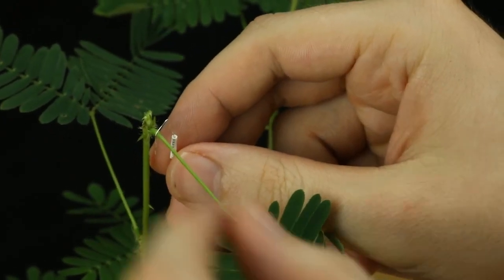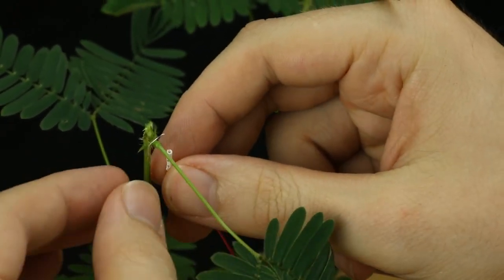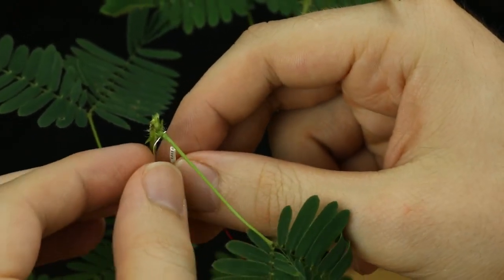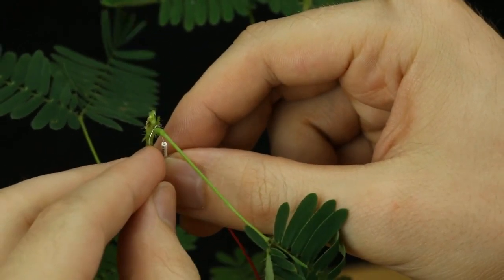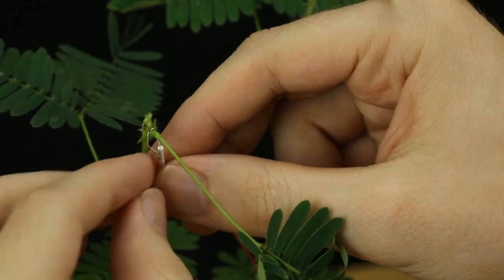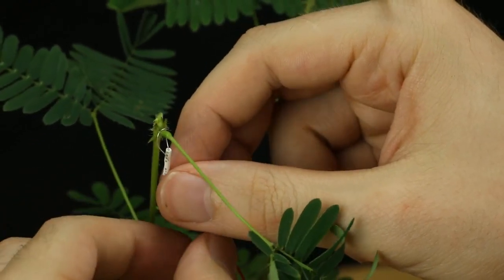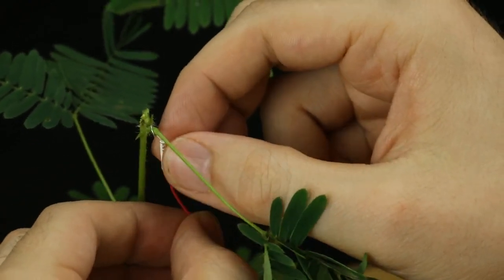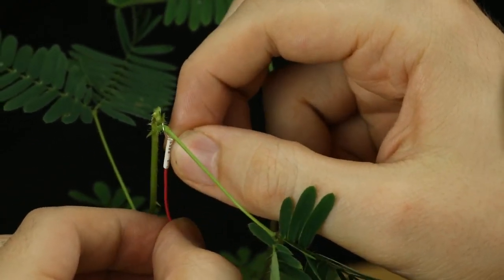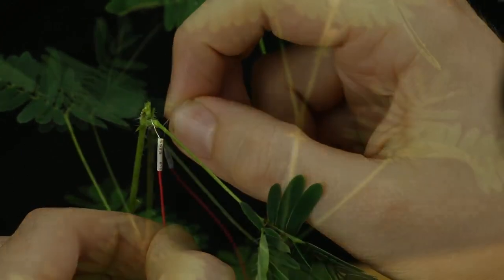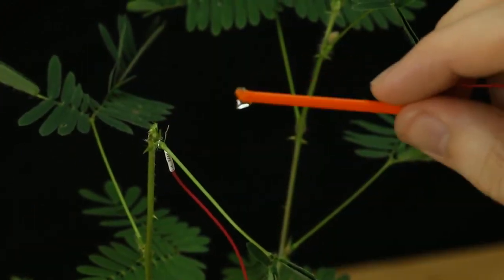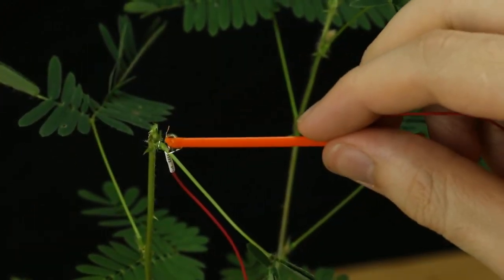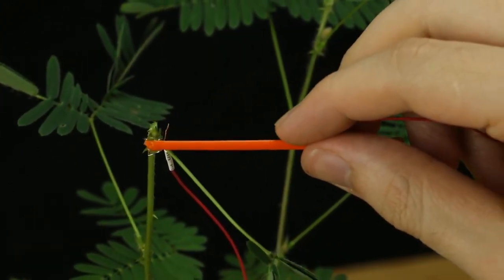You'll begin by picking out your sensitive mimosa, picking a branch, and wrapping the silver recording electrode around where the branch meets the stem of the mimosa. Pull it snug and tight, and then add just a little dab of recording electrode gel to complete the connection.